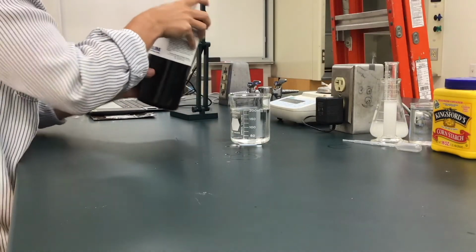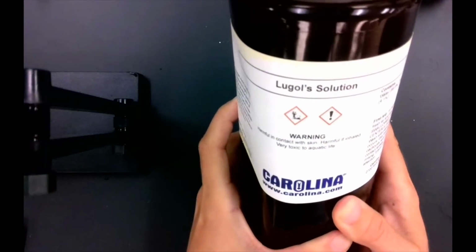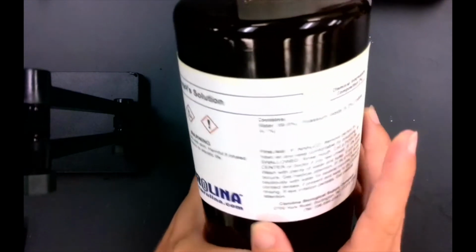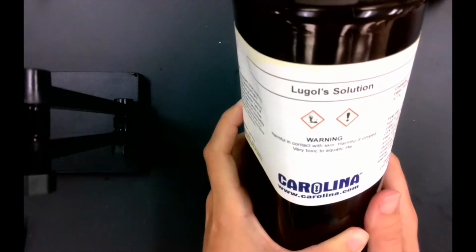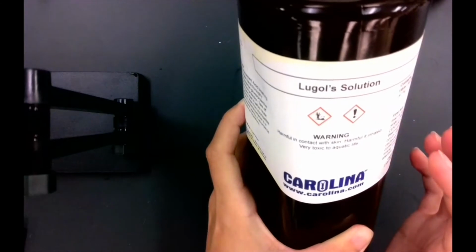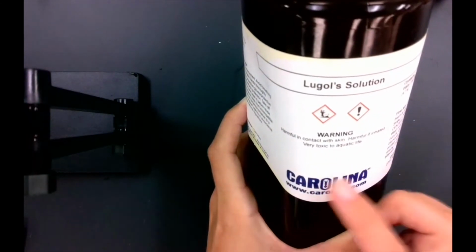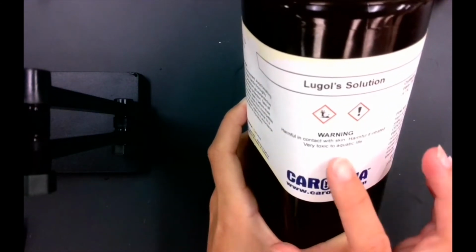So the one way that we can do that is to use Lugol solution. Lugol solution is a potassium iodide, iodine-based solution, and it is able to turn a specific color when it interacts with starch solution. Keep in mind that there are warnings for this. In the lab, if you were to work with this, you would have to use gloves, and we would request you not pour it down the sink.